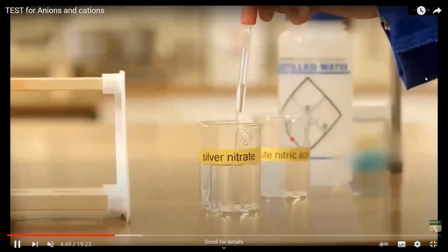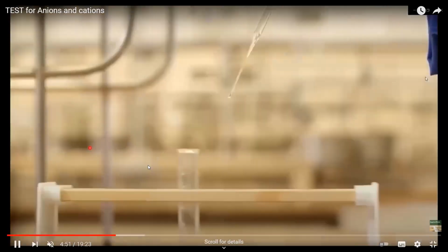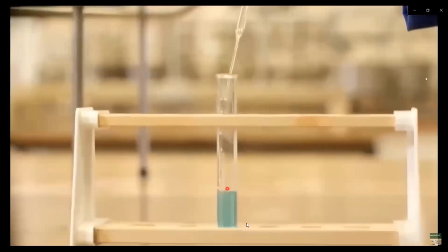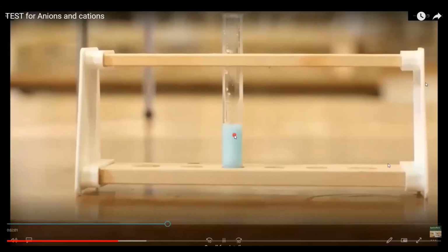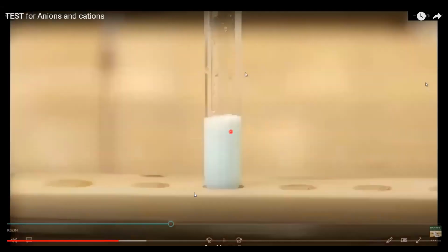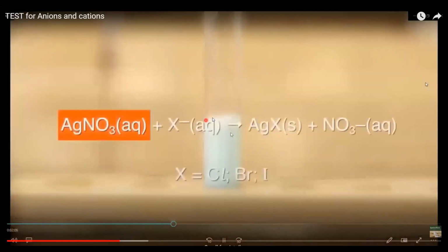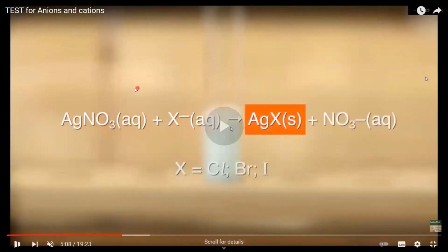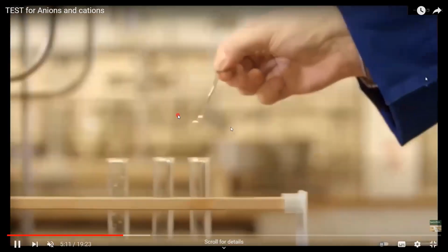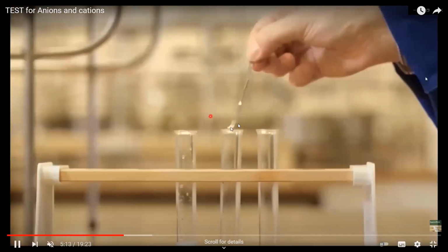So when we add silver nitrate solution, you can clearly see a white precipitate. If there is a white precipitate, this gives an idea that this salt is a chloride salt, because the chloride ion takes the position of the nitrate in silver nitrate, so this gives a white precipitate.